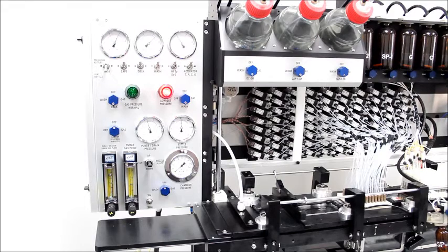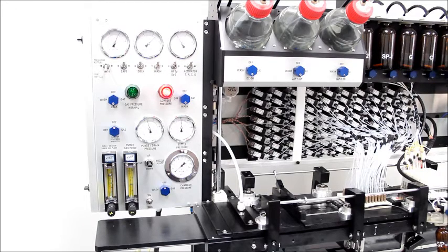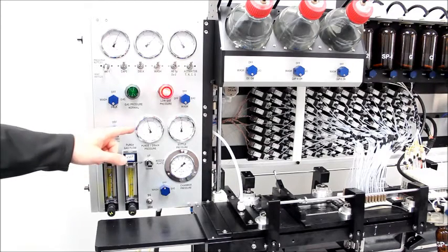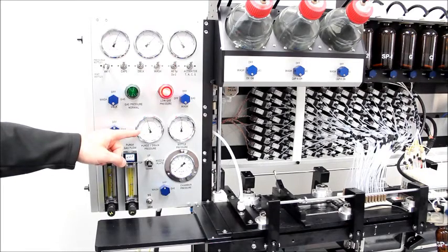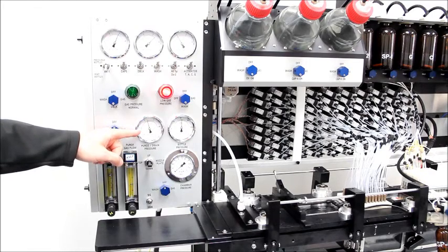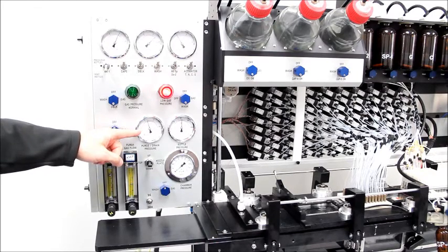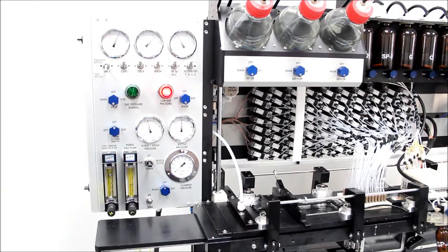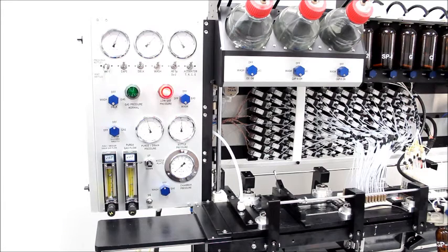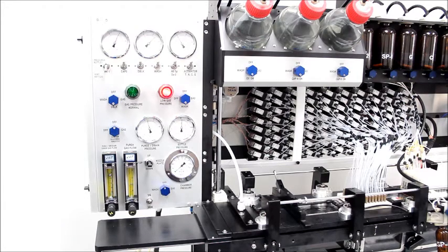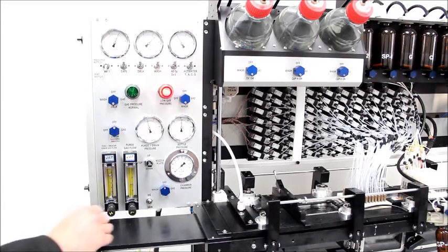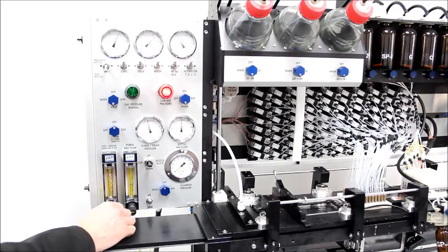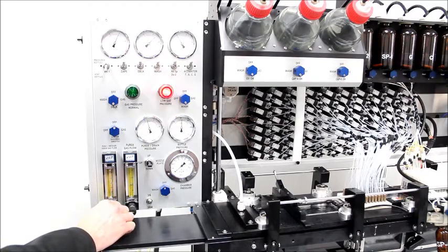Now, the flow of reagents through the synthesis columns is regulated by the purge and drain pressure shown on this gauge right here. Additionally, slower flow of reagents through the columns may be achieved by the use of these two flow meters here.